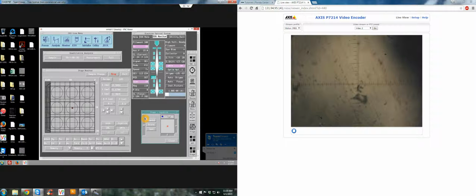Alright, there. Did you see that? The crosshairs came into focus. Let's see, and then now they're out of focus. I'll bring them back into focus. Right, oh, just out. So this takes a little bit of practice getting it together. So right about there, it's more or less in focus.